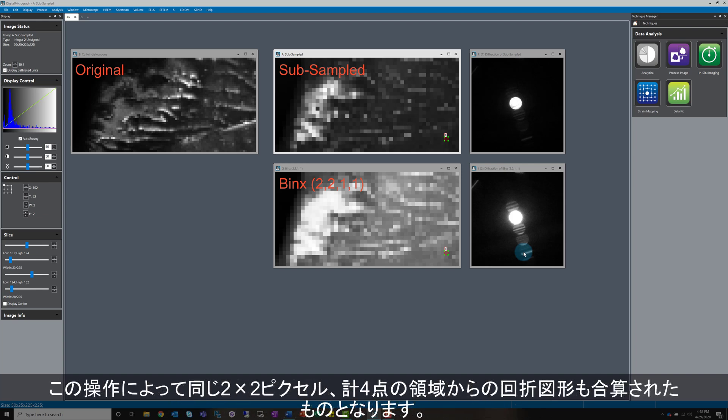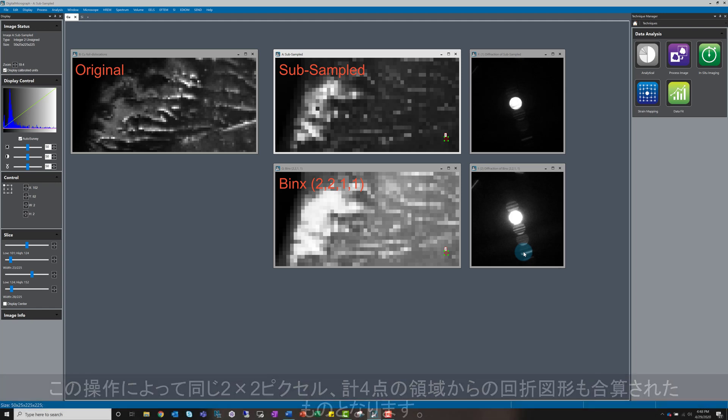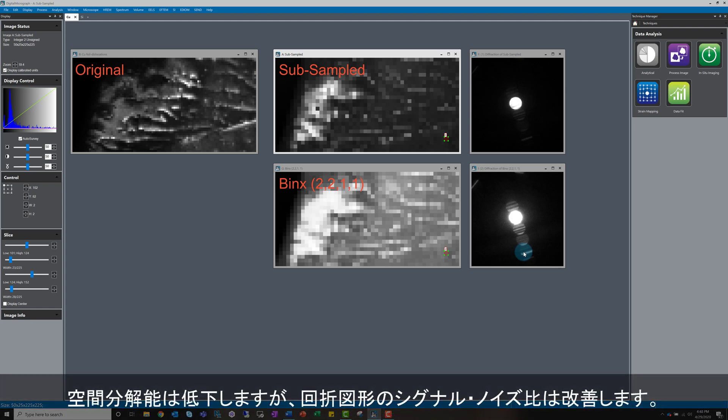It's also going to sum the 4 corresponding diffraction images from these pixels and assign the summed image to the new binned pixel. By doing this, I am reducing my spatial resolution, but the signal-to-noise ratio in my diffraction images will go up.